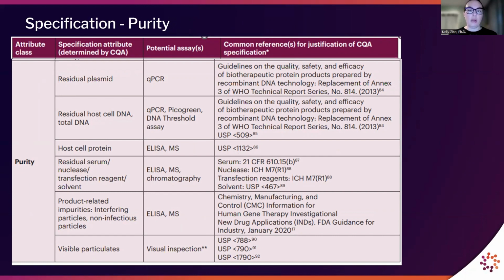We talk about impurities. The lentiviral vector manufacturing process should be designed to reduce impurities as much as possible through the upstream and downstream manufacturing steps. And it's still important to measure impurities in the final vector drug substance, since these impurities may interfere with analytical methods for both the lentiviral vector and the CAR-T products. And that's often the case with high levels of residual plasmid DNA. What's more, the residuals can also negatively impact the T-cell manufacturing process, and lentiviral vector residuals might even pose a toxicity risk to the patients if they're carried through to the CAR-T process in high enough levels.